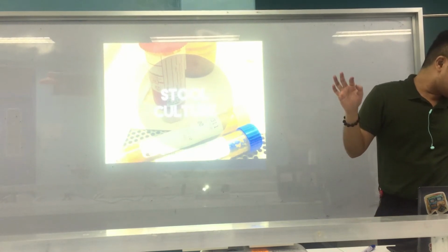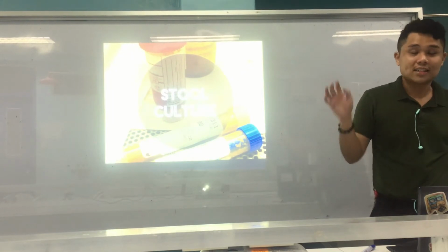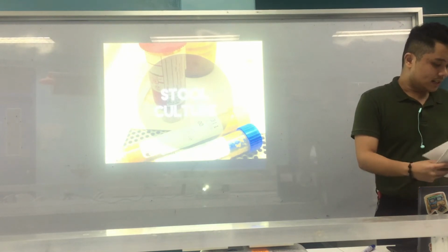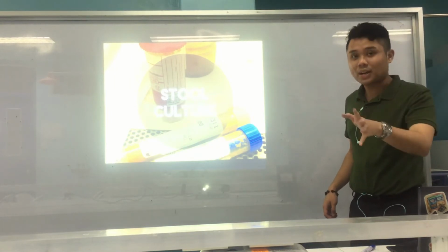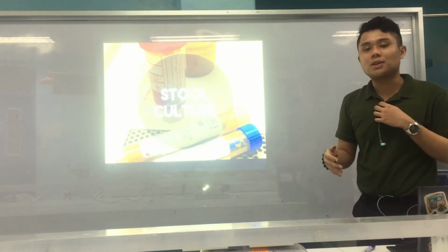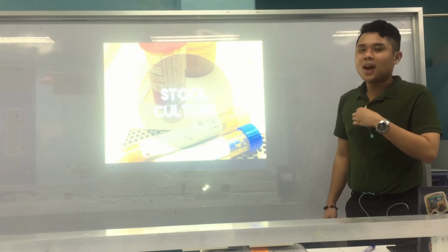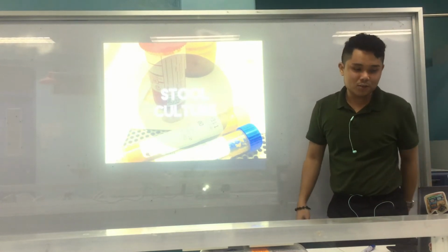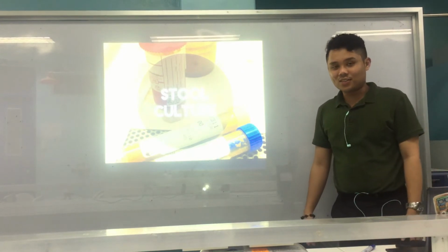In brilliant green agar, S. typhi cannot be detected. Bismuth sulfite is the one that can detect Salmonella typhi. So bismuth sulfite agar is specifically good for isolation of S. typhi, while brilliant green agar is for the other Salmonella species except S. typhi. These additional mnemonics may come out in your exams or in the board exam.